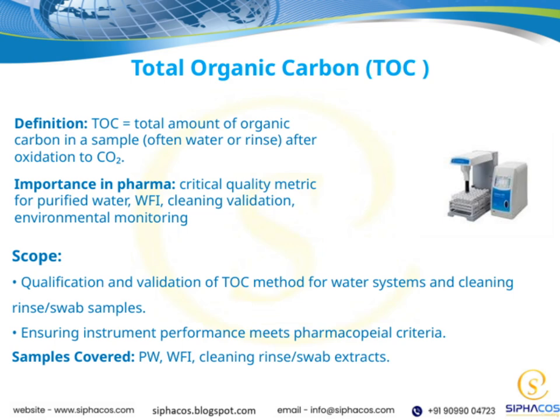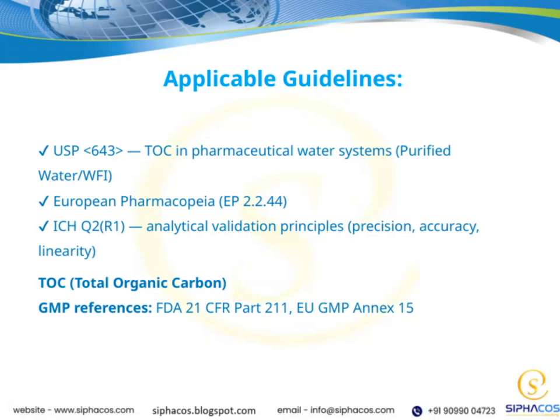It's used to evaluate purified water, WFI, and cleaning validation processes, as well as environmental monitoring. Essentially, it helps us ensure that our water systems are clean and that our cleaning procedures are effective, safeguarding product quality and patient safety.